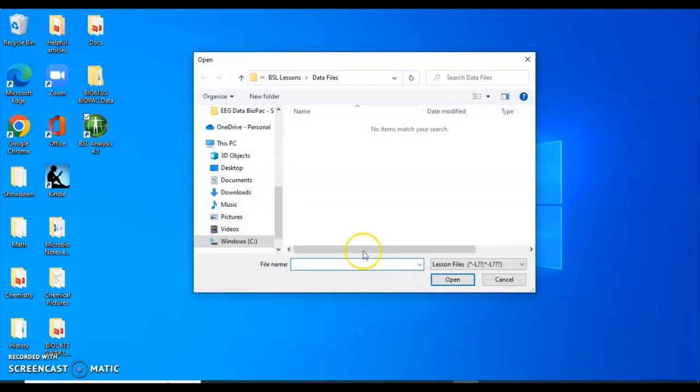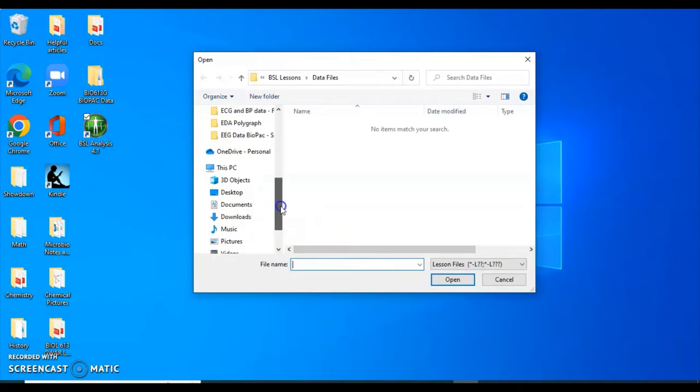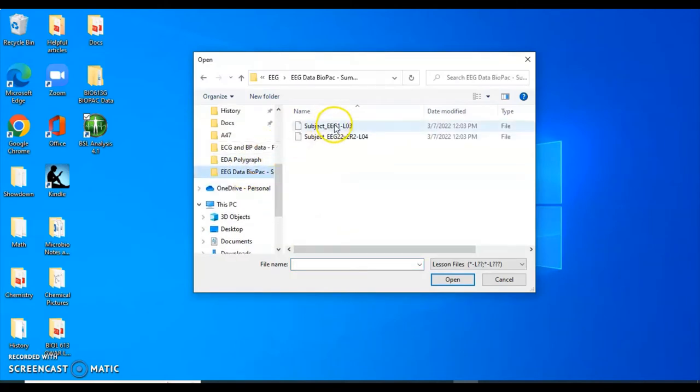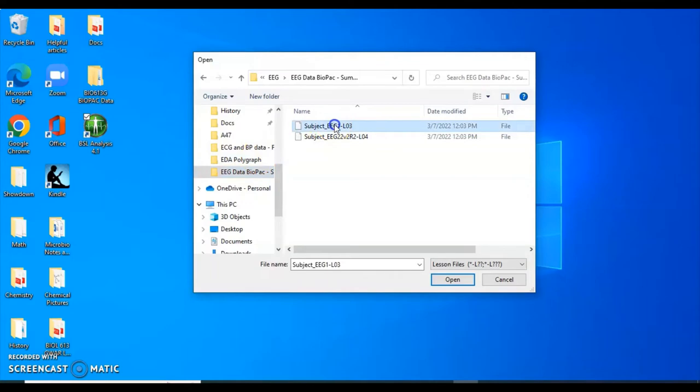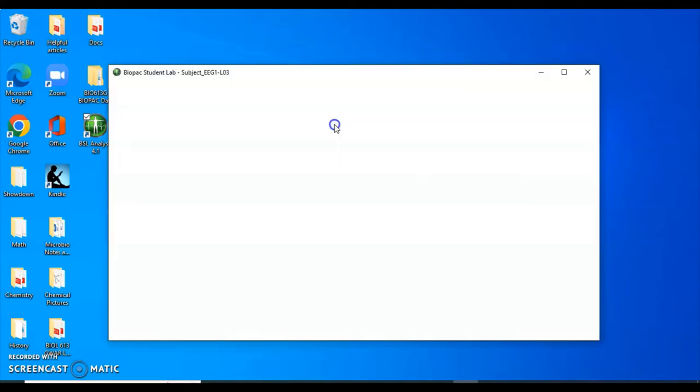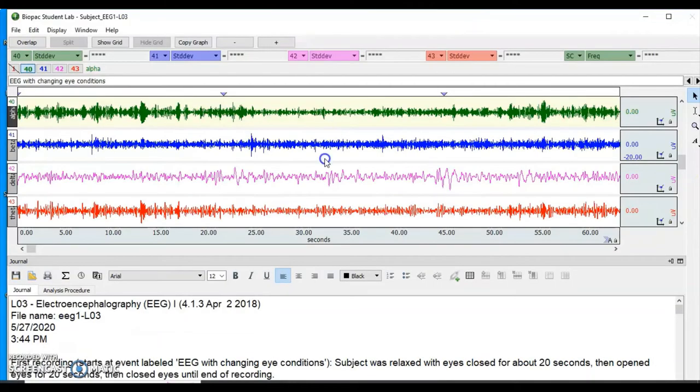and you should be able to choose your files. Simply select the BioPak data you want to analyze, and a screen like this should pop up.